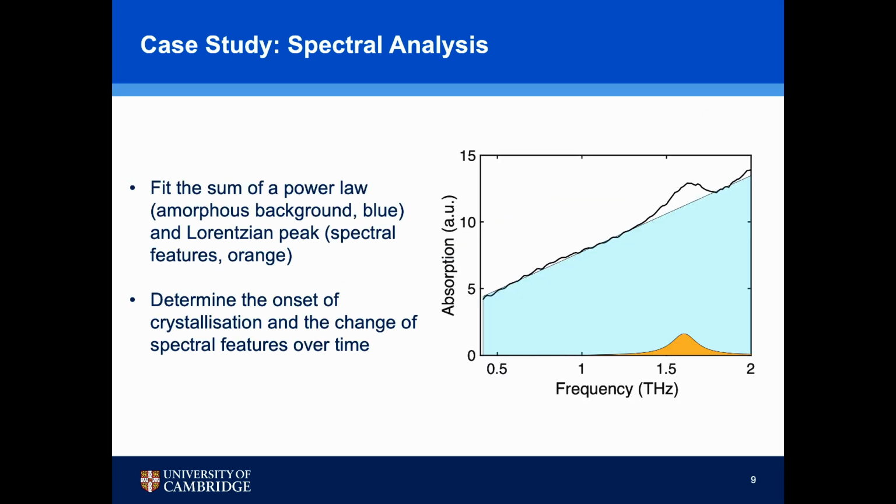What we also do is we fit the spectra with the sum of a power law that reflects the amorphous background, and we also fit the peak with a Lorentzian fitting. By this, we determine the onset of the crystallization and the change of the spectral features over time.